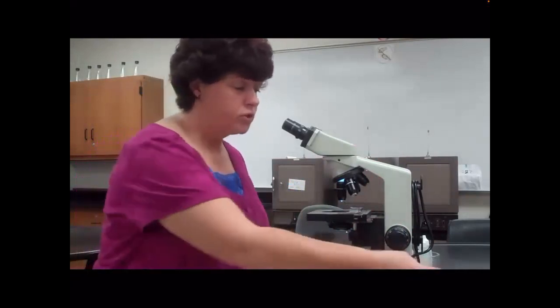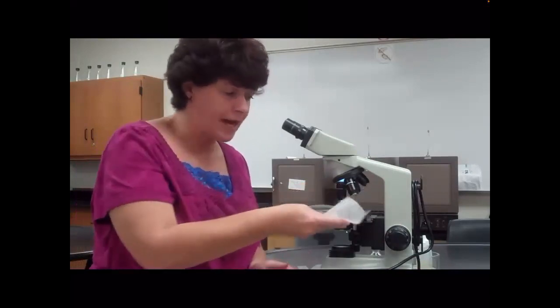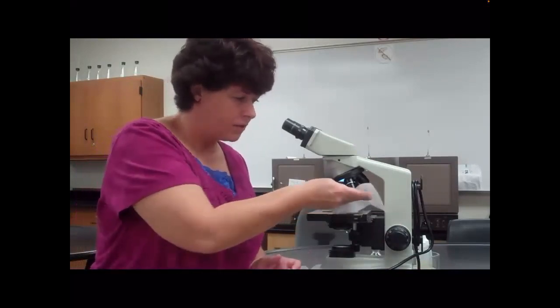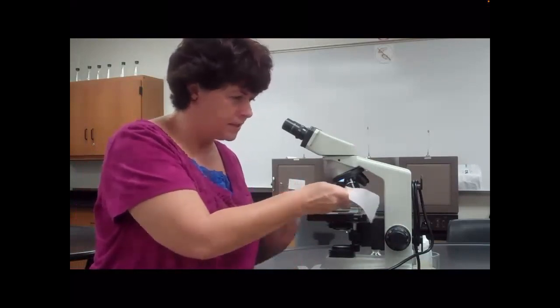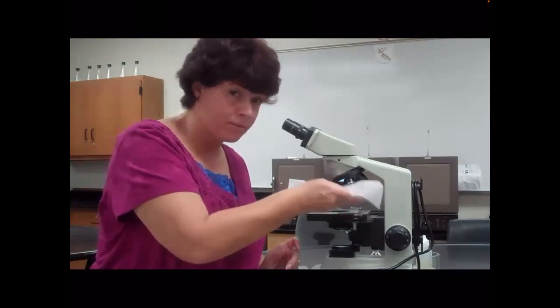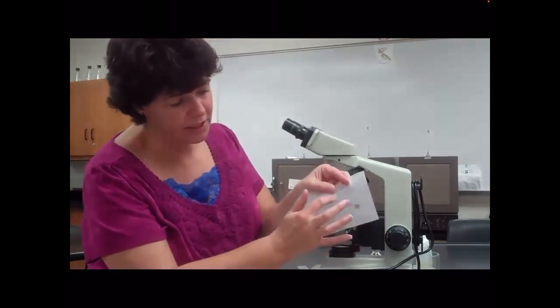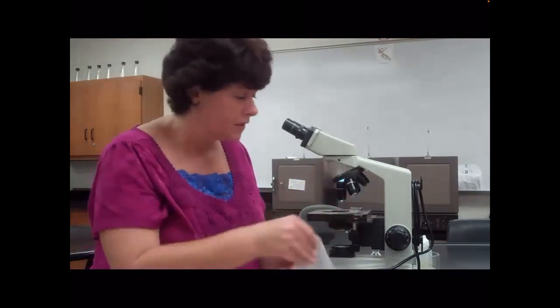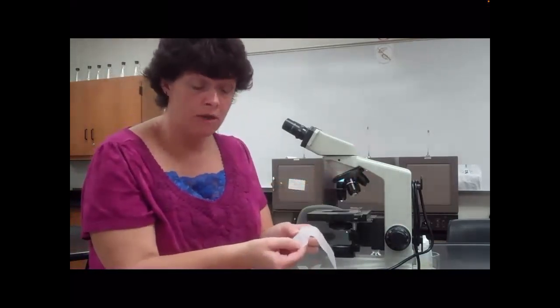And I do not want you to rub it off, and I want you to be very gentle, okay? So you just take the paper and you dab, and you go to a dry spot and you keep dabbing until no oil comes off. Do you see how I'm just gently dabbing? I'm not pushing really hard and I'm not rubbing. I don't know if you can notice, but there's where the oil started, and as I dabbed, it got less and less and less. So if you dab and nothing comes off, that means you're done. Don't use a liquid to clean it off or anything.